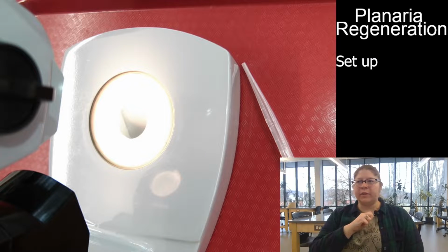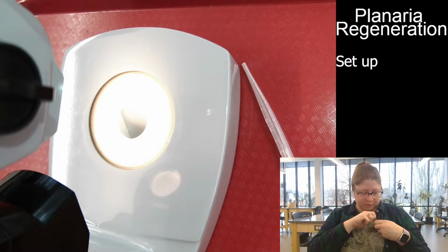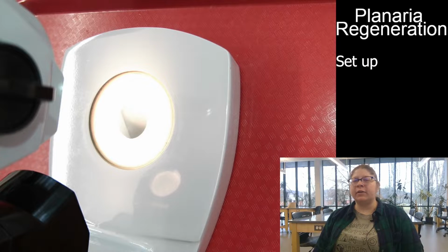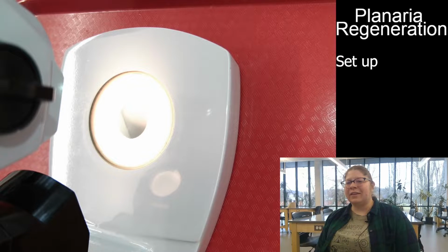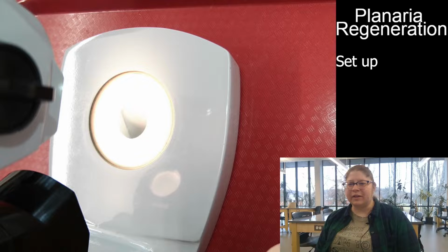So here we are with the Planarian Regeneration experiment, and what you're seeing on the screen are the hands of Professor Rick Oliver helping me with this video. He is taking the planaria out of the jar that they came shipped to us in using a transfer pipette to just suck one of them up into the bulb of the pipette and then squishing it back out gently to remove it from the pipette and place it onto a microscope slide that was stored in the freezer.